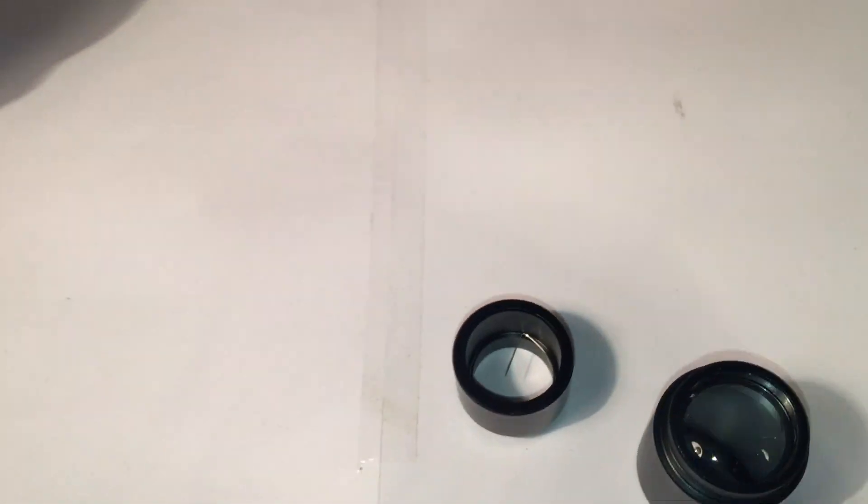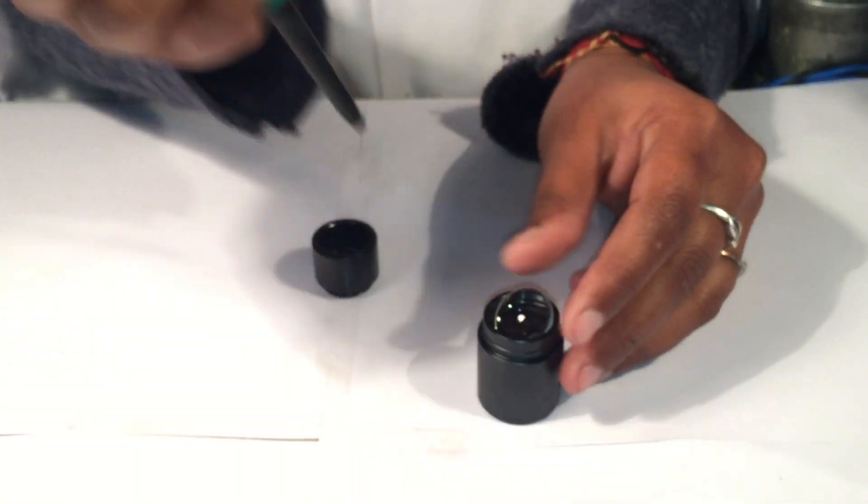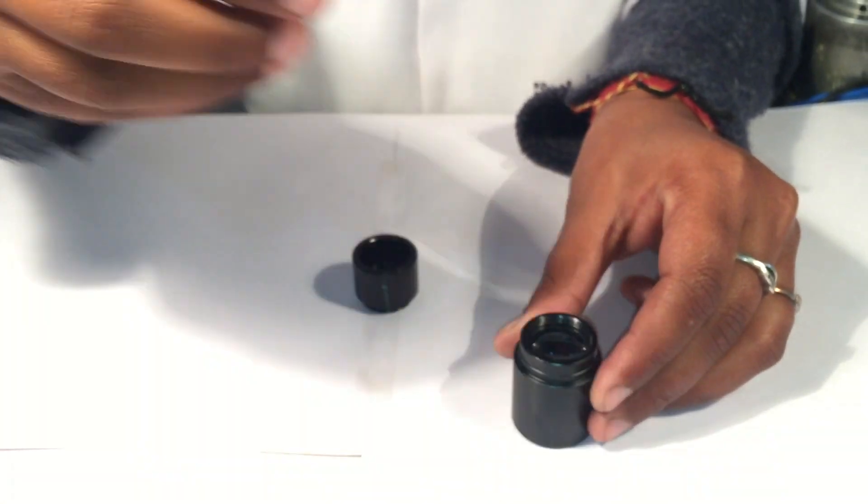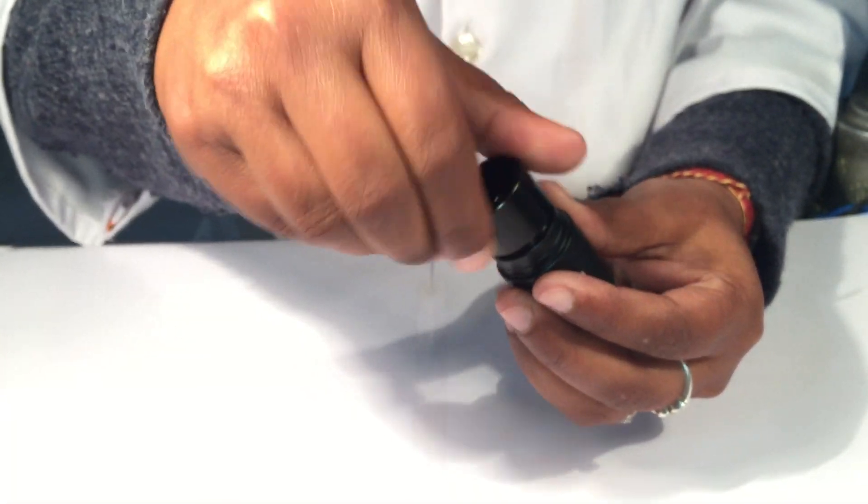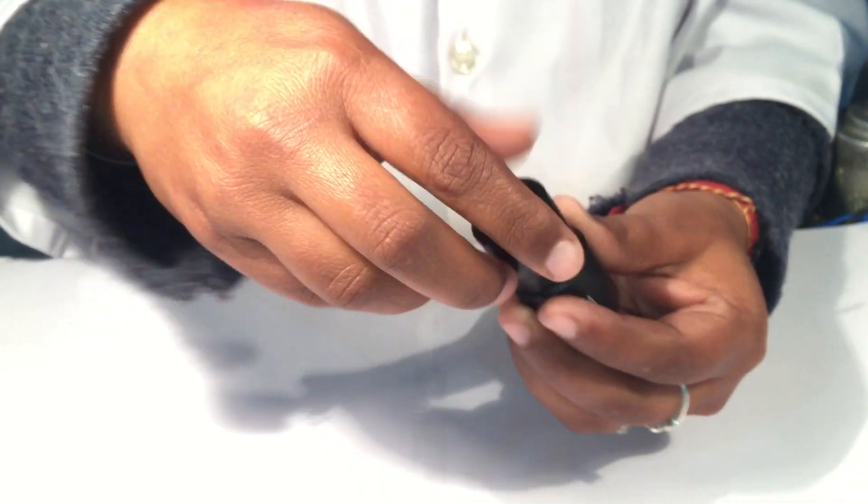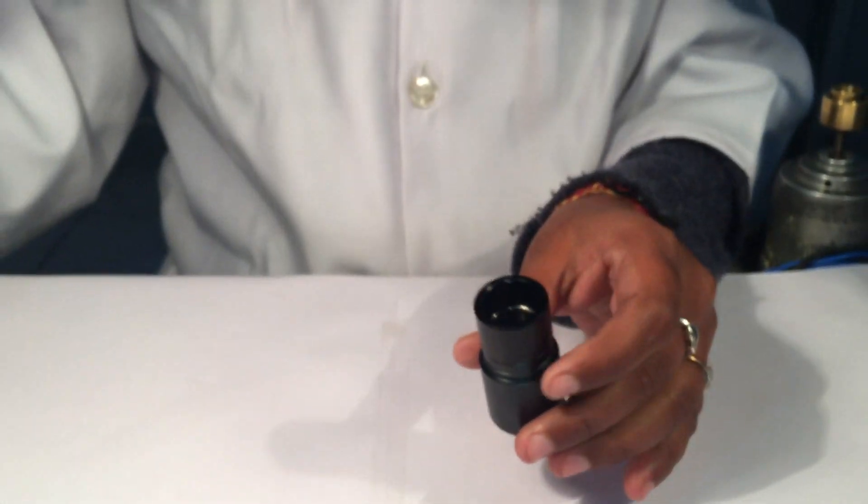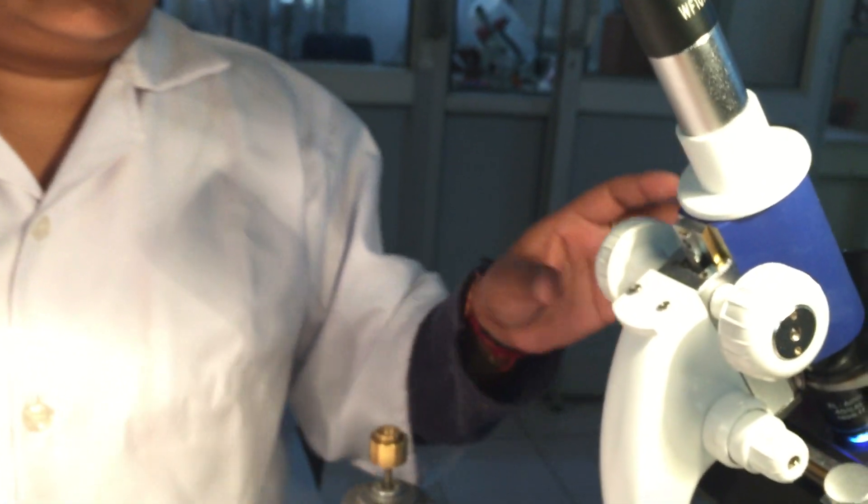So when it is done, you can air blow it. Now we will screw the lower part to the eyepiece and we will check on the microscope that the pointer is working perfectly.